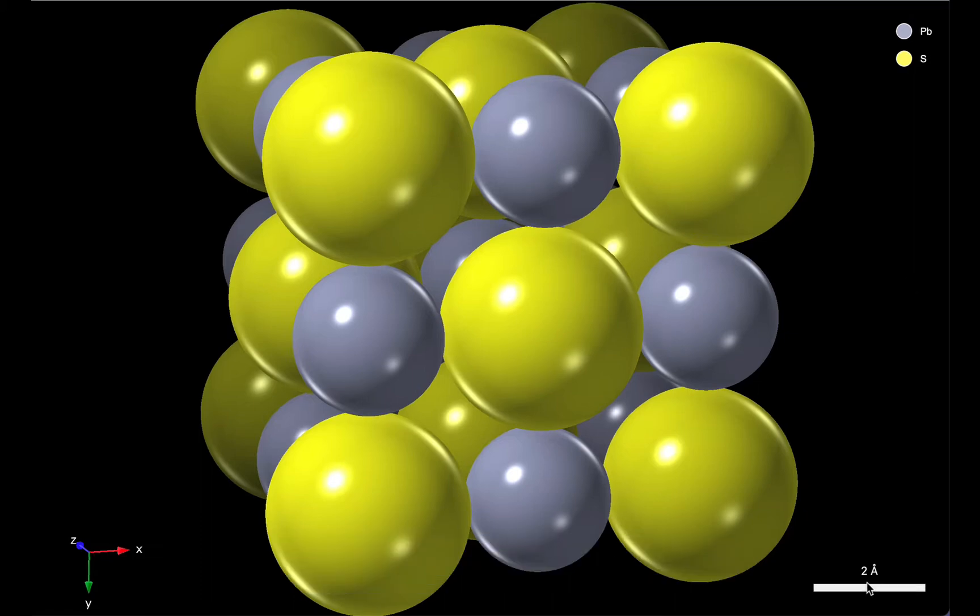In fact, we can click and drag the scale bar and use it as a kind of microscopic ruler. So if I position it over this lead atom, you can see the lead atom is about two angstroms in diameter, one angstrom in radius. This sulphur atom, yellow sulphur atom, is a little bit bigger.